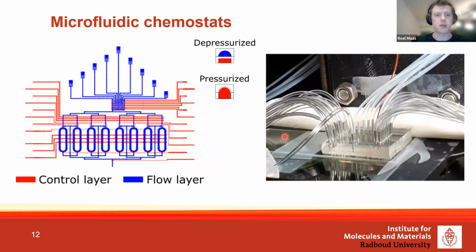Then we come to the microfluidic flow reactors we have been using. Those reactors are based on the reactors designed in the group of Sebastian Merkel. I just saw she's also in the audience, so thank you for making this beautiful reactor. We tweaked them a little bit, but how they mainly work is that the reactor consists of 2 different layers: a flow layer and a control layer.